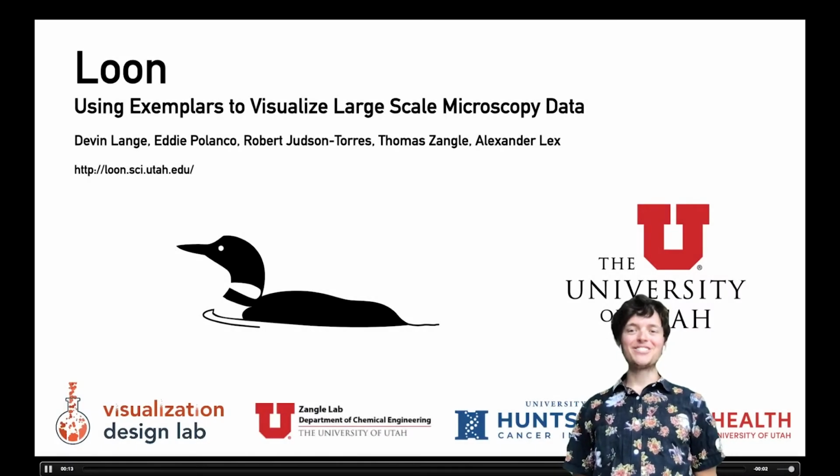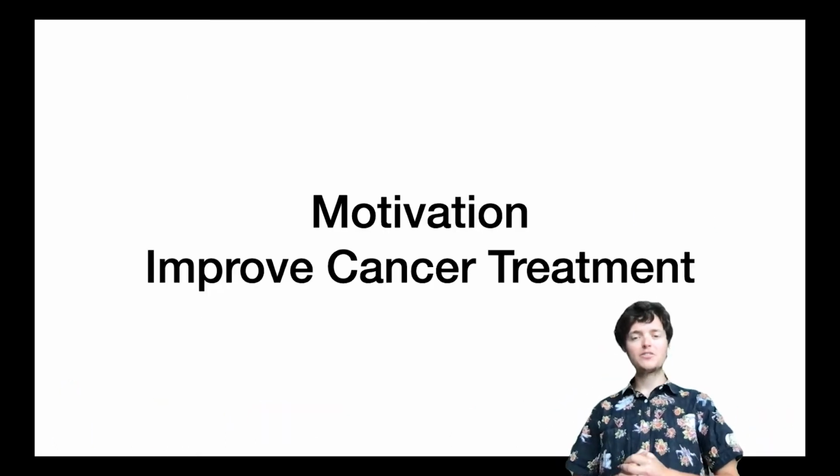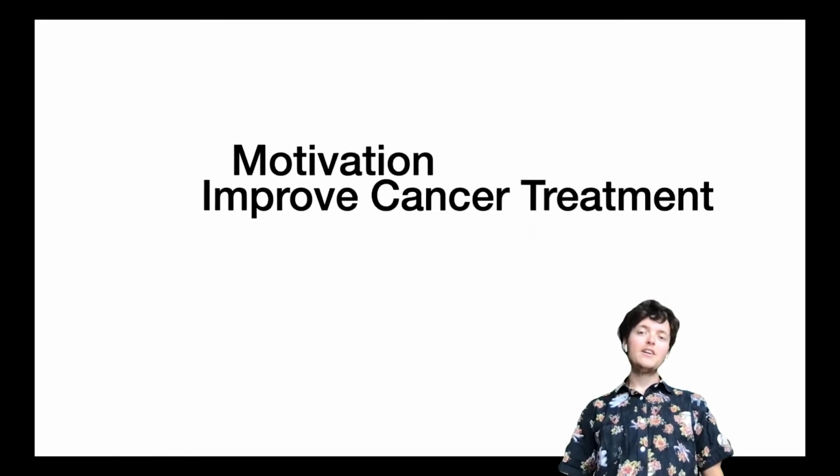Hello, my name is Devin Lange, and I'm going to be presenting on Loon, a new tool that we developed to visualize large-scale microscopy data using exemplars. The overall motivation for this project is to improve cancer treatment.